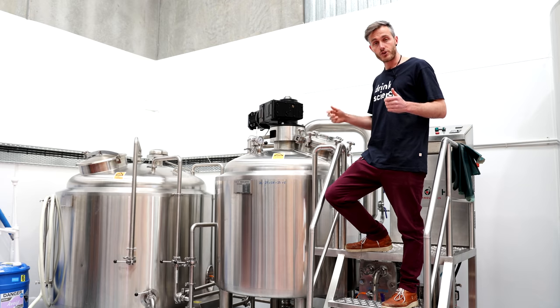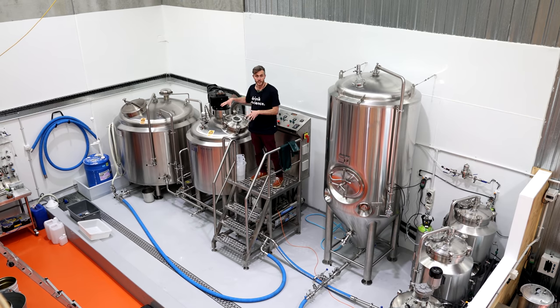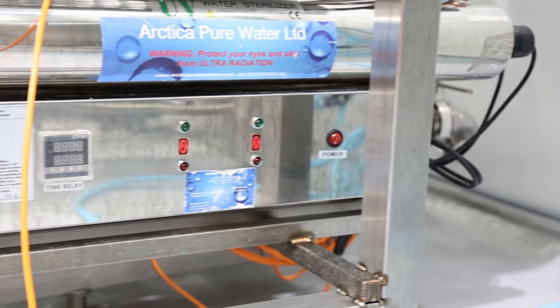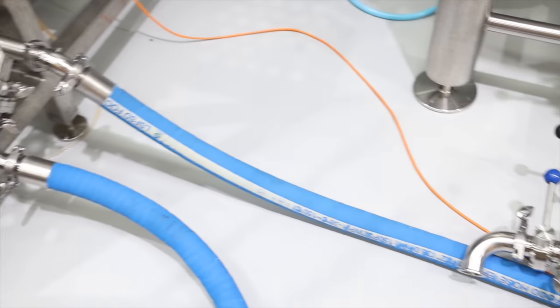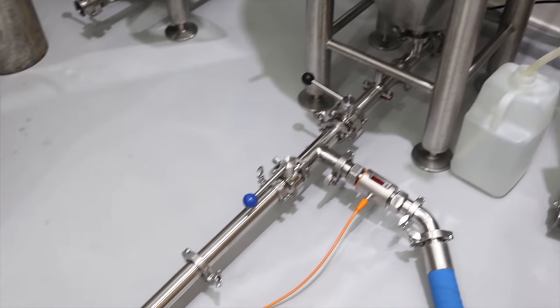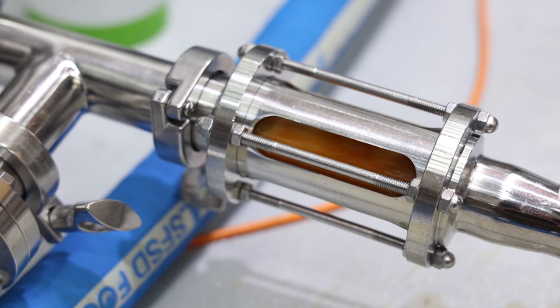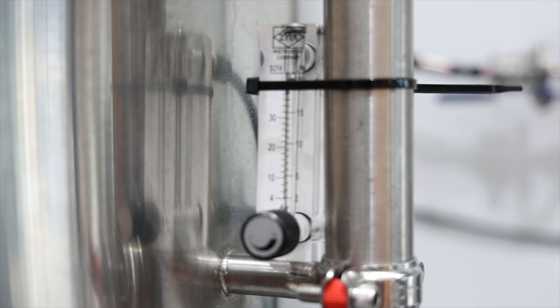We can dose in our yeast nutrients. The high gravity wort being stronger is pumped down through here into our heat exchanger, diluted with sterile water, and together those go into our propagation vessels. Normally in a brewery or a distillery, yeast turns sugar into carbon dioxide and alcohol. But in this case, a constant supply of oxygen in the form of filtered air ensures that the yeast stays in reproduction mode and they end up with almost no alcohol produced.